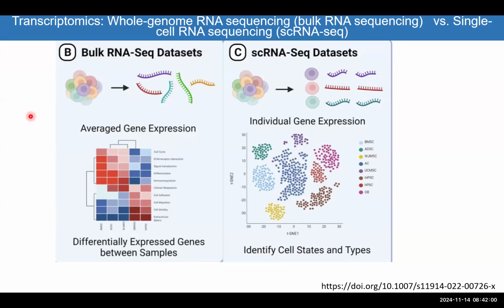So this is already good because it gives us a good overview of the difference between a healthy subject versus a diseased person, or a diseased tissue, sorry. Then we can get the averages. So we can say that there are 5 samples here. We could already see that the first 3 have high cell cycle expression, and the last 2 have low cell cycle expression.